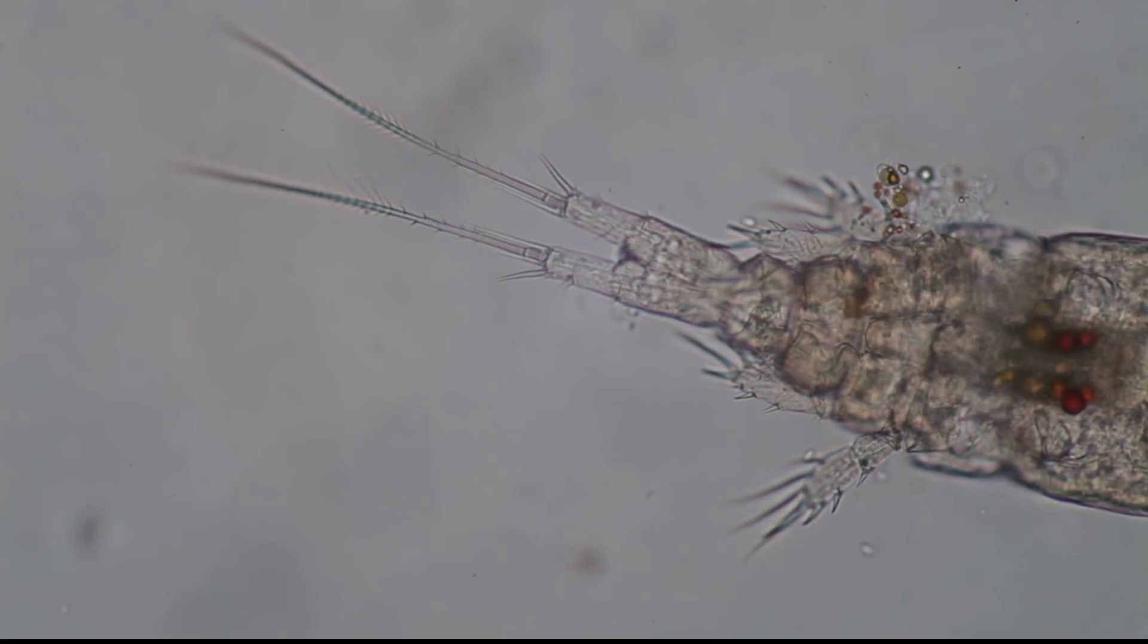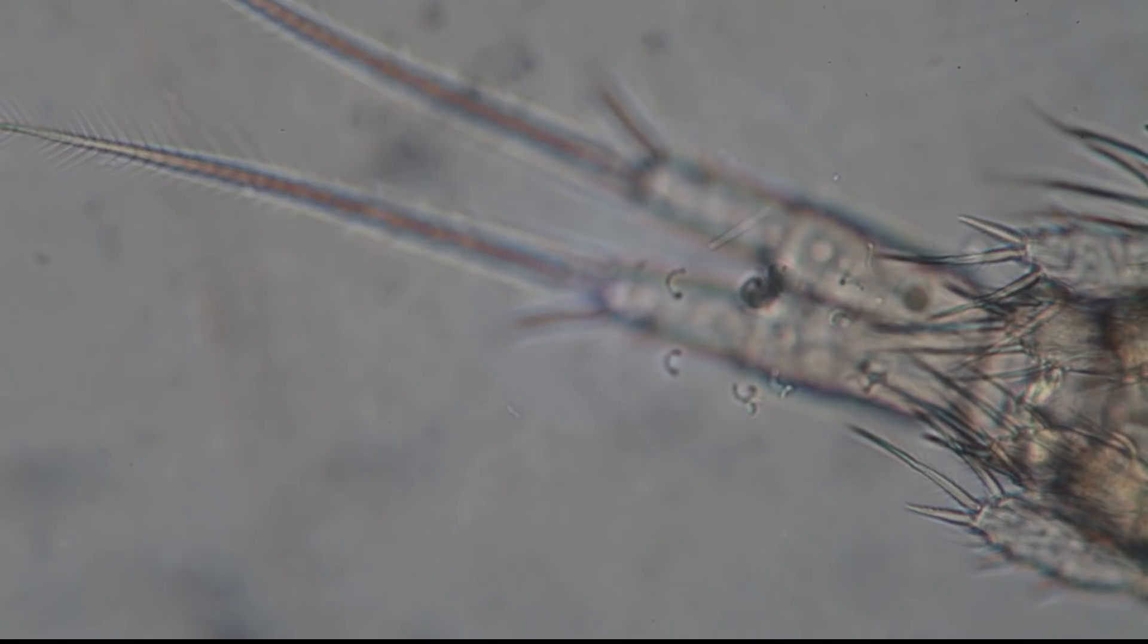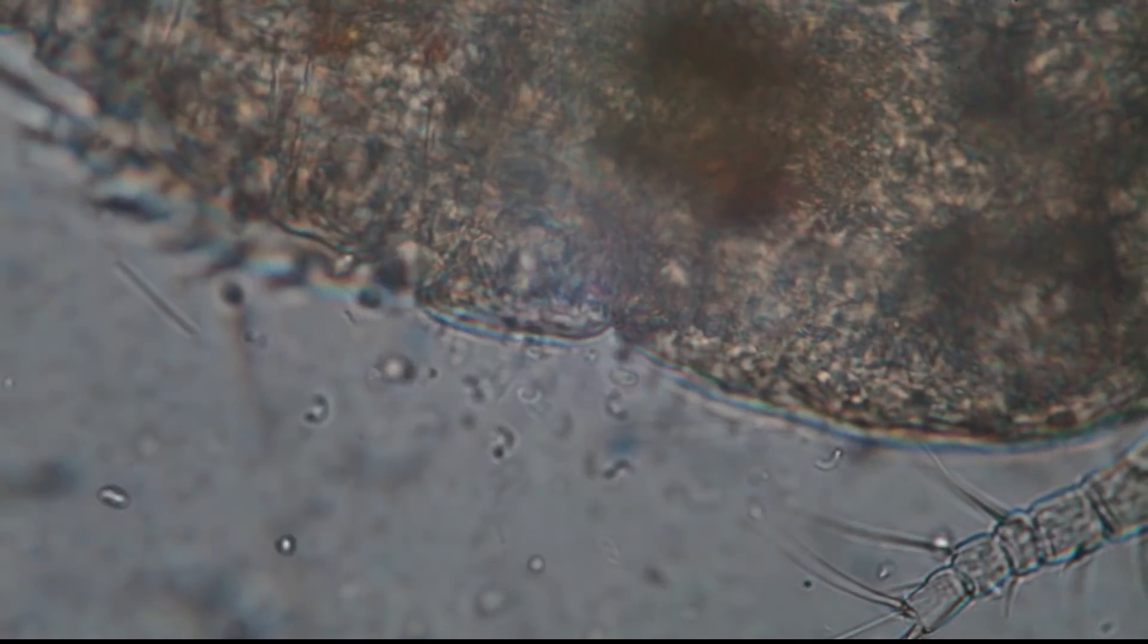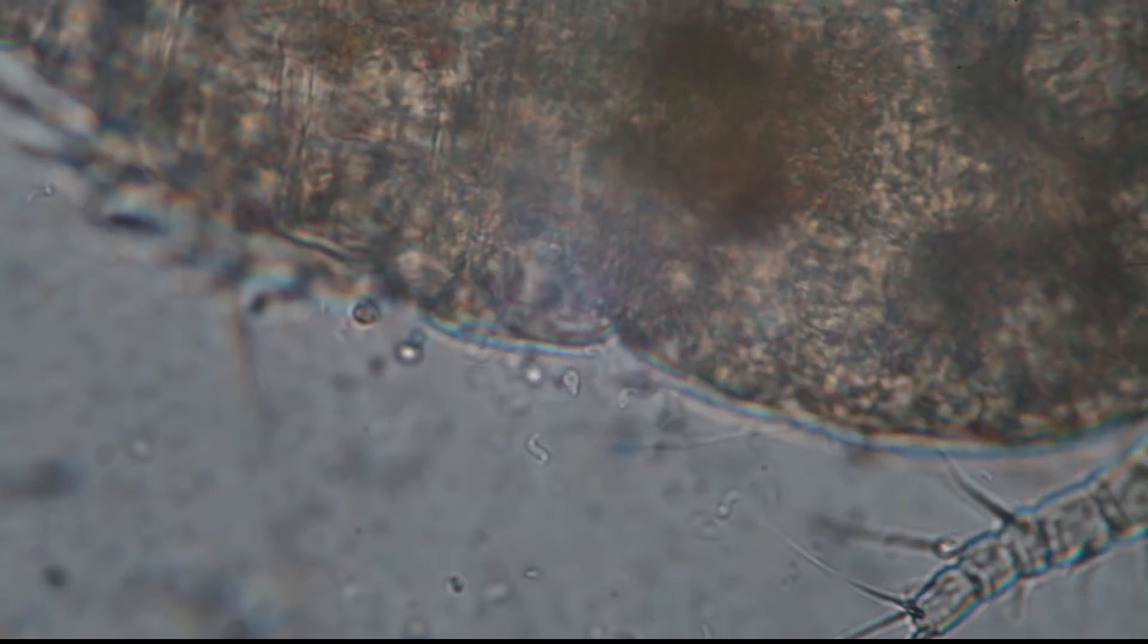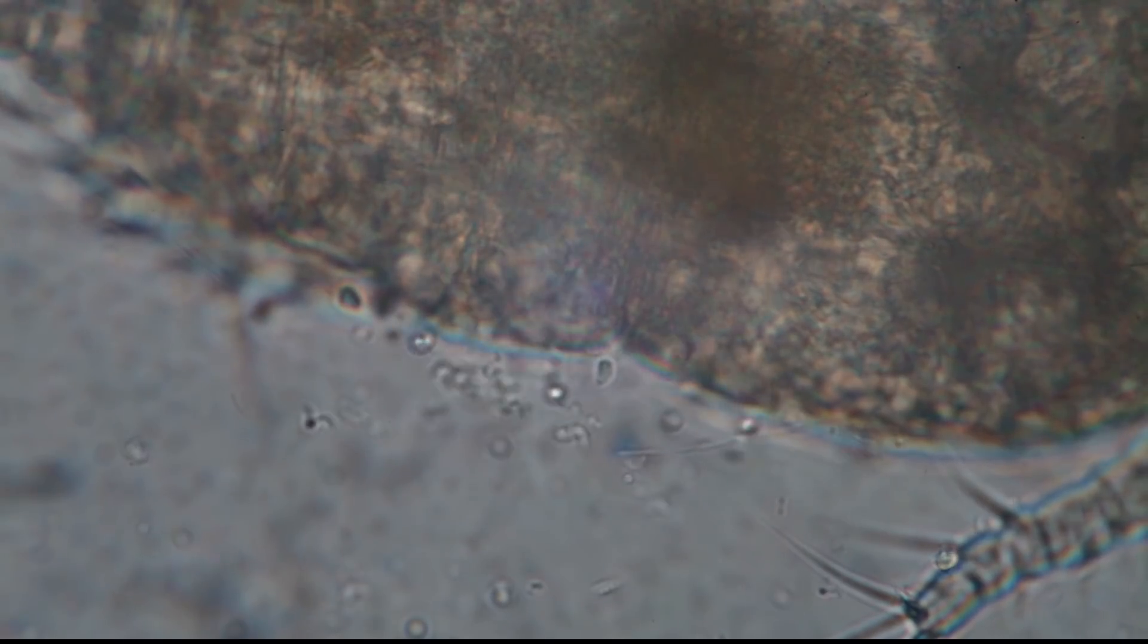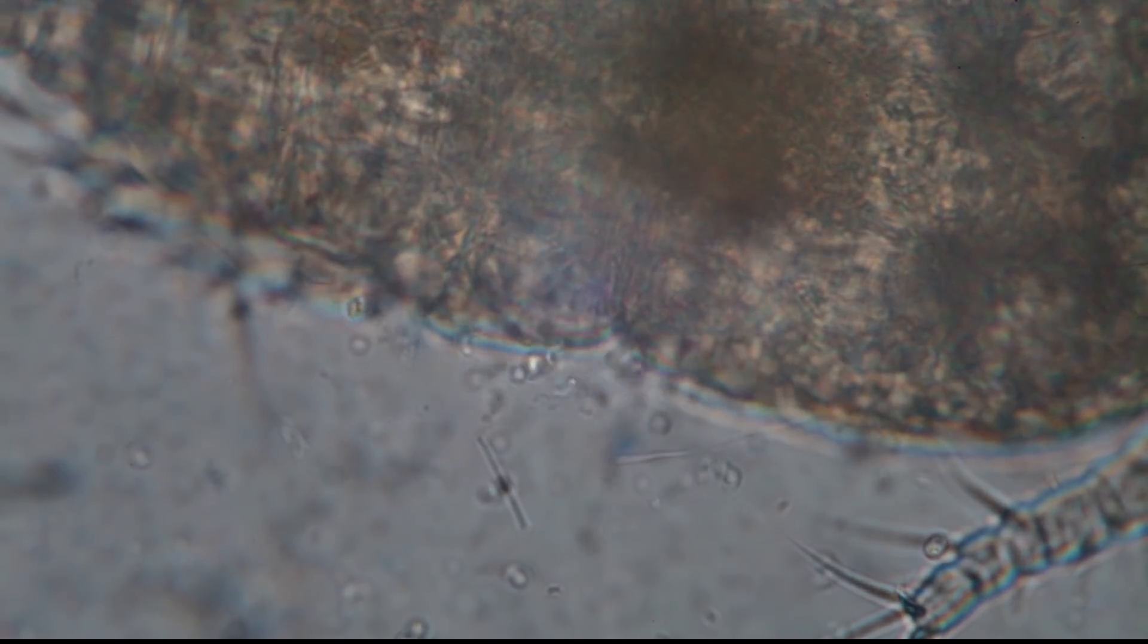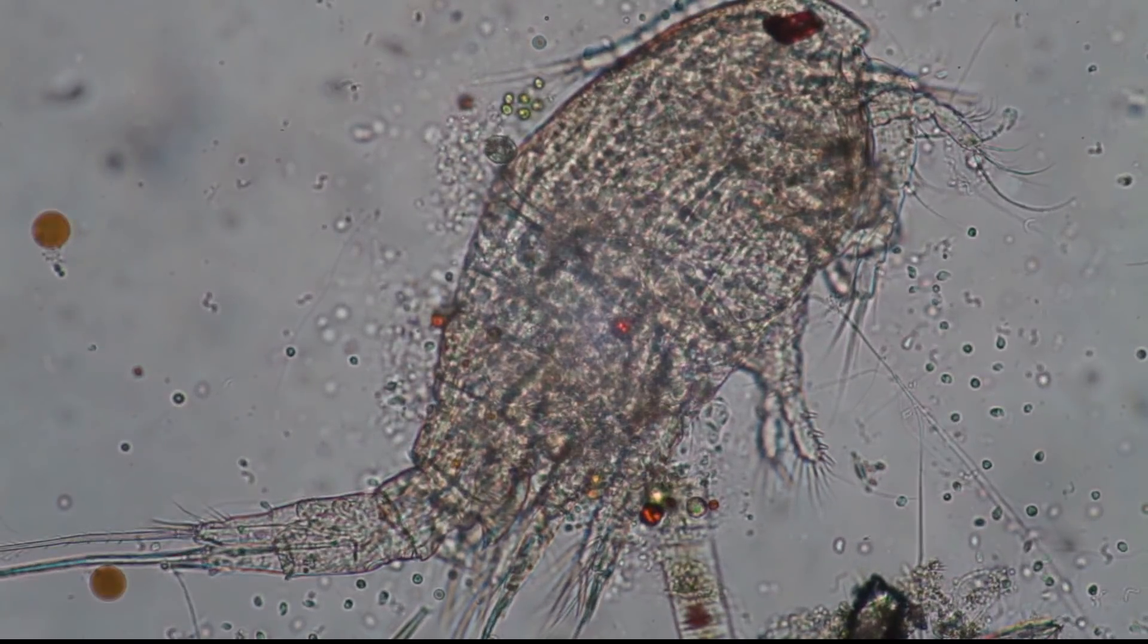You can also see that there are some other water organisms there, which I don't really know what they are. But here there are again the spirilla and you can see now how they are turning in a spiral-like manner. And here there are lots of them again. Lots of them. You can actually, I looked at this with a 400 times and 600 times total magnification. So you should be able to see them with pretty much any decent microscope. So nothing special is necessary here. But one of the surprising things again is that you're able to see these bacteria that well.